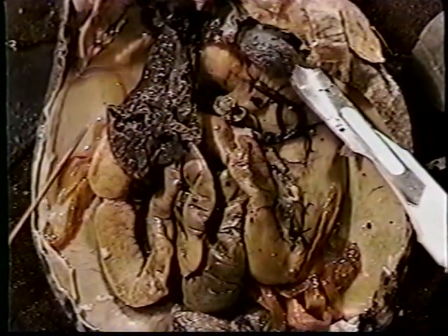The skin and blood vessels are a very integral part of the frog's respiratory system. At closer examination, we can see that the lung is truly an air sac.